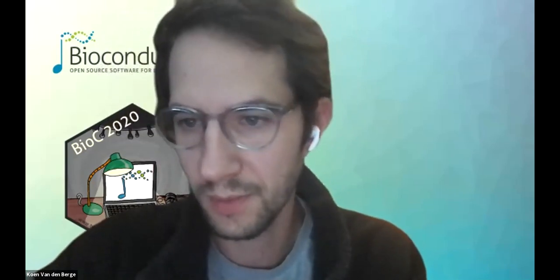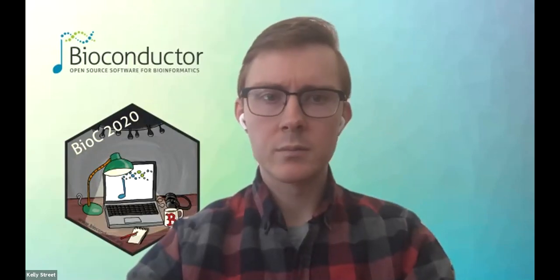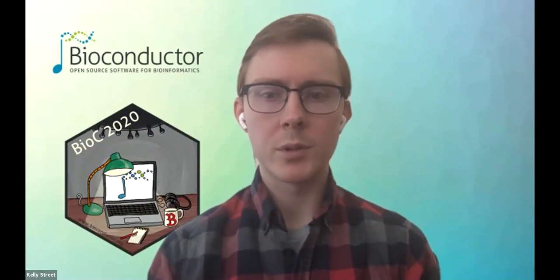Yeah, that's what we're doing. I'm not sure if we checked the heat maps without the scaling, I should say. I think I can see what they're saying: if you had similar patterns, but there was a shift between the conditions, that might not show up in the heat map, but that would still be something that we picked up with the test.